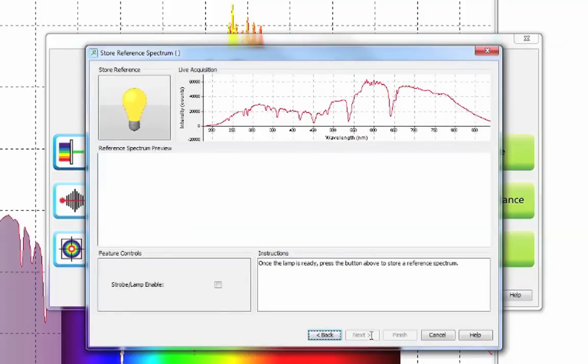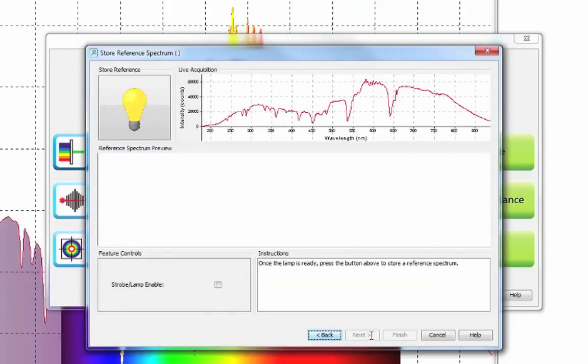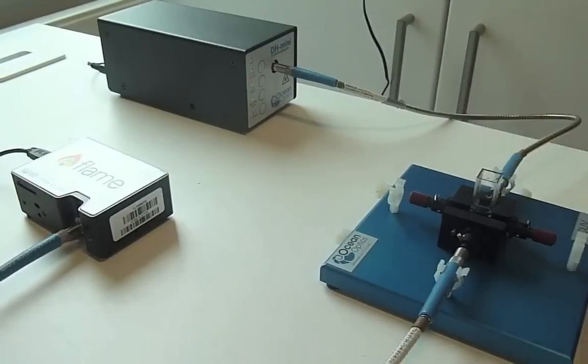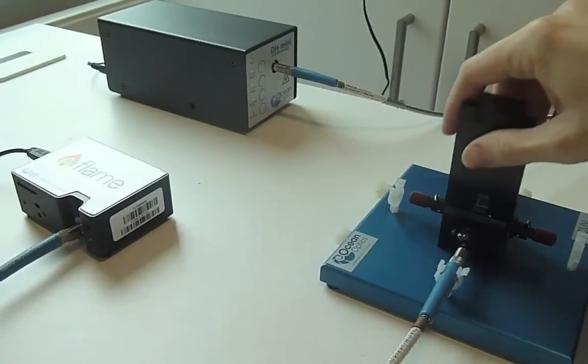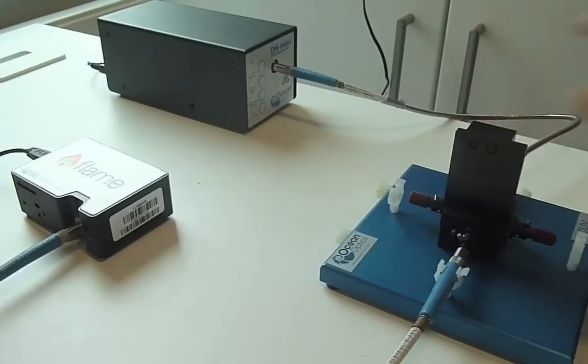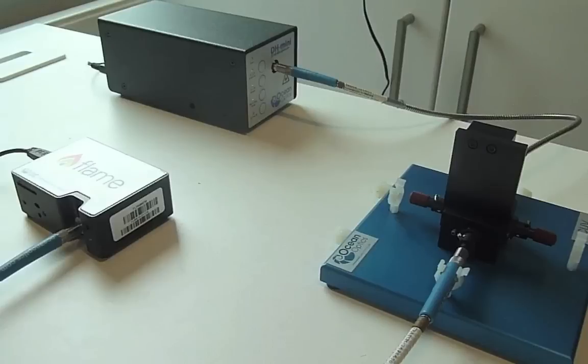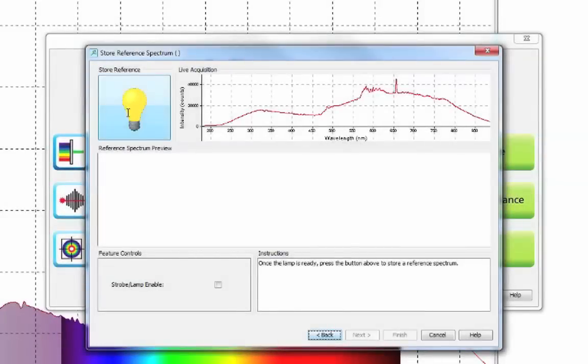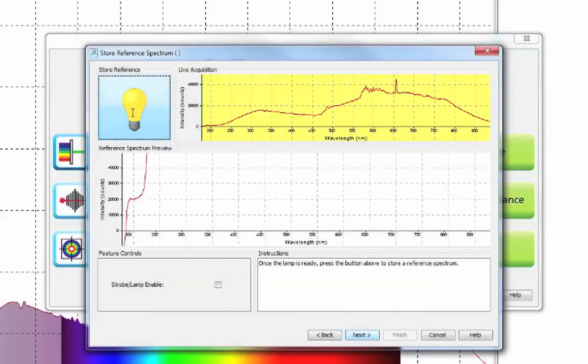Continuing with the wizard you will be asked to take a reference. To do this you must use your reference sample. Water is often a good choice. Place the water sample in the cuvette holder. Ensure that your light source is on with the shutter open. Then click the yellow bulb to take a reference.